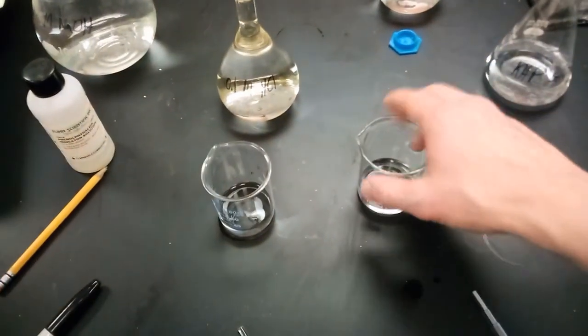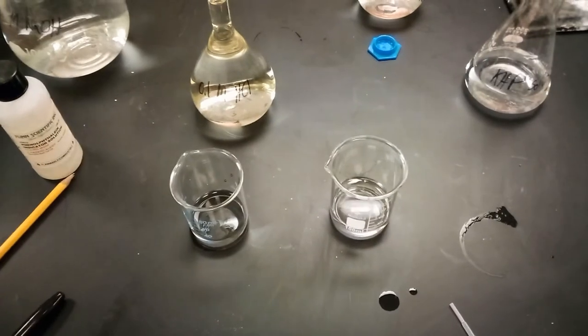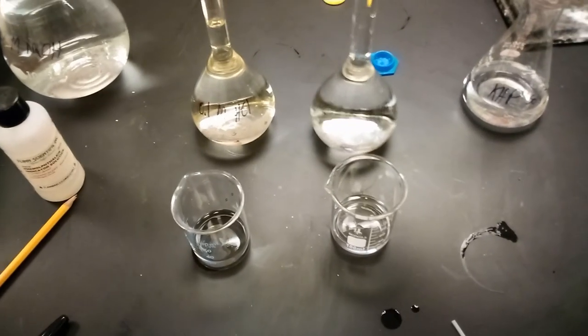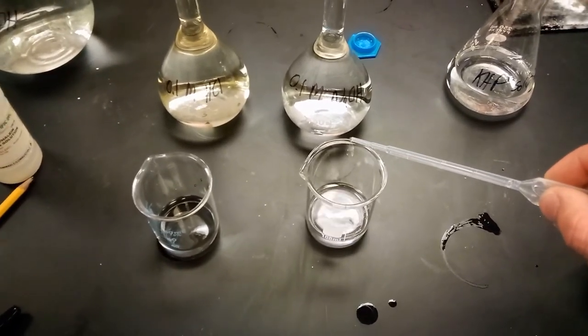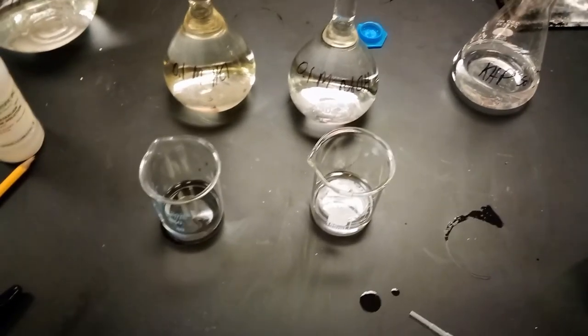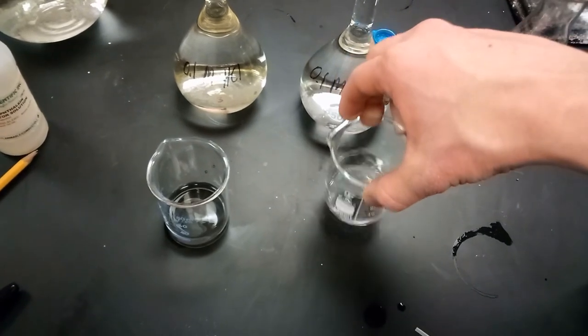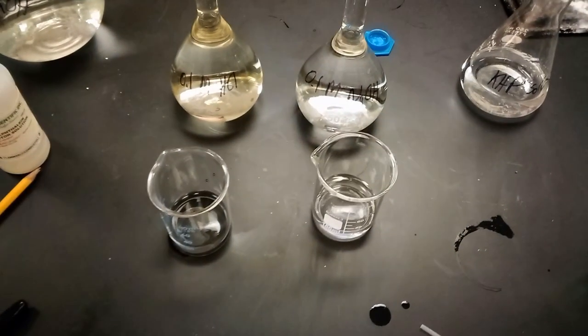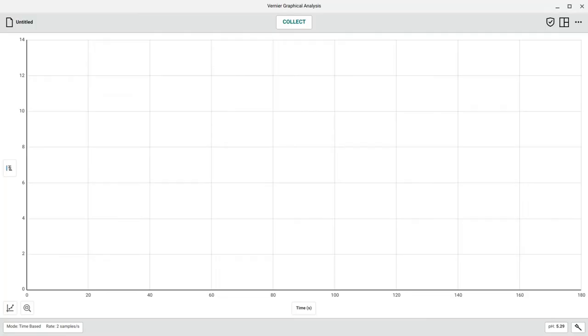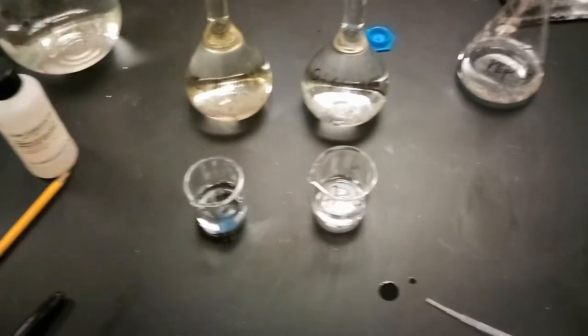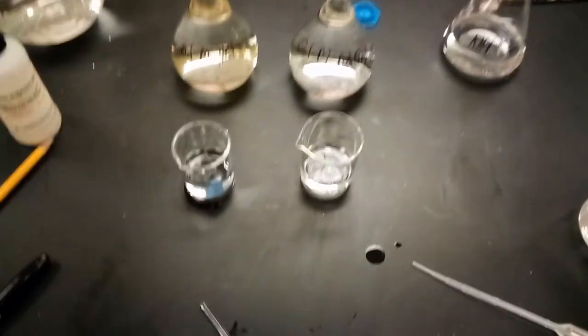Similarly, into the beaker on the right, this is also the KHP buffer solution. We'll be adding 0.1 molar sodium hydroxide to this one, about five drops of this as well: one, two, three, four, five. The five drops have been added. So now we want to stir it like so, and we'll put the pH probe in there and let it stand. Again, because this is a buffer, we expect to see very little changes in pH levels even after addition of a strong base. And we'll compare the results of what happened with the buffer solution to the results of what will happen when we use regular distilled water.